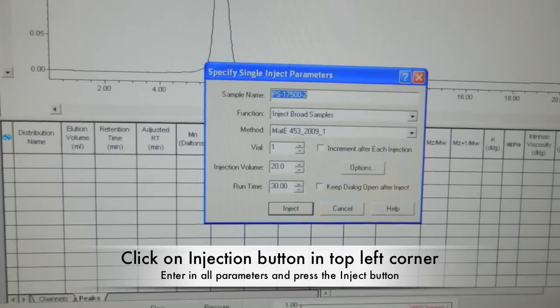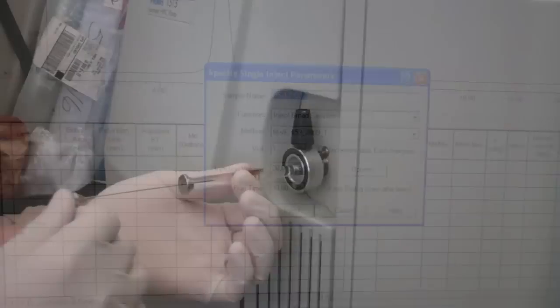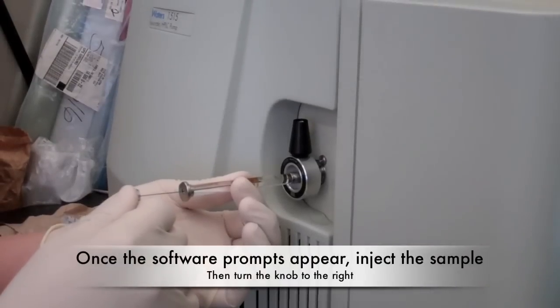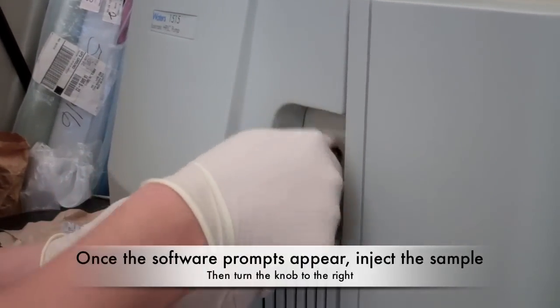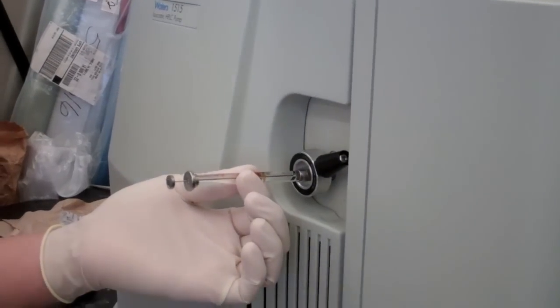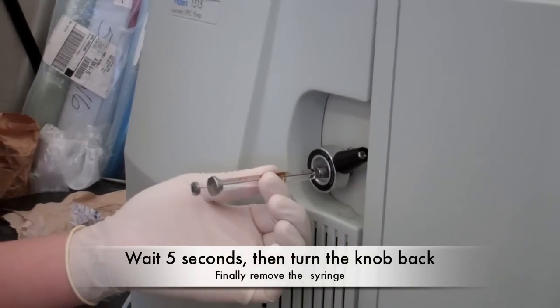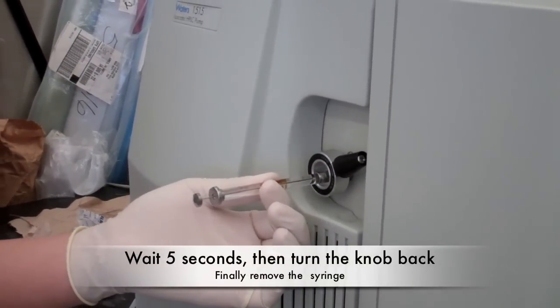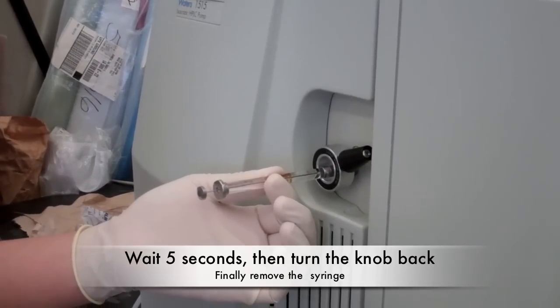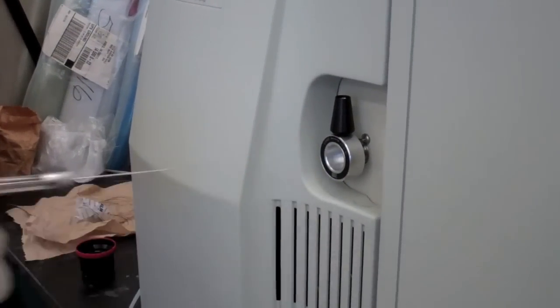Click on the injection button in the software and wait for instructions. Once the instructions appear, slowly depress the syringe to inject the sample, then turn the knob to the right and wait 5 seconds. After 5 seconds, turn the knob back to the left. Carefully remove the syringe.